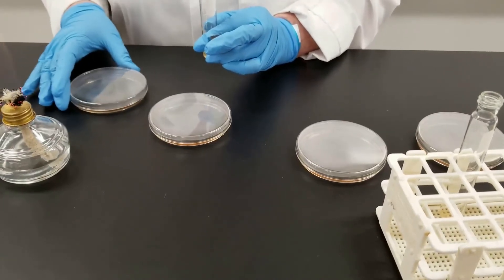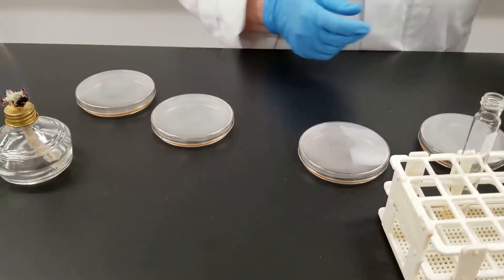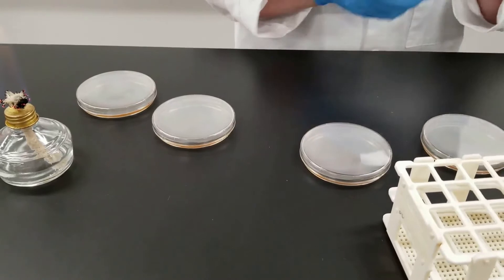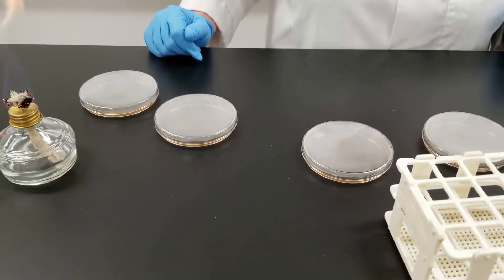Swirl this last plate, and like I said, we'll set these aside, let them solidify. When it is done, then we will incubate them - always incubate them inverted. We'll incubate at 37 degrees for 24 hours and then come back and look at them.